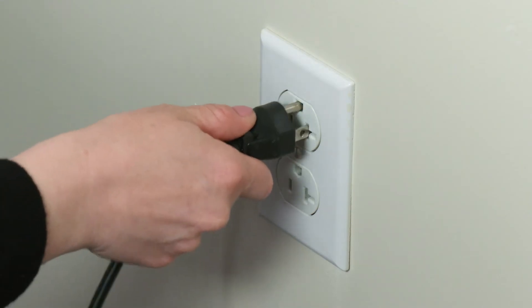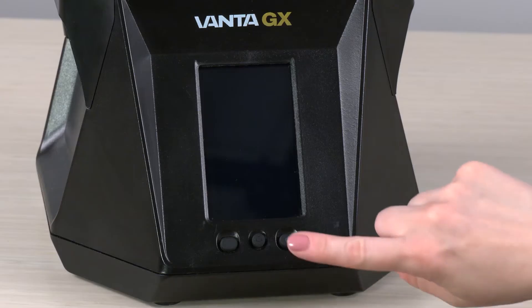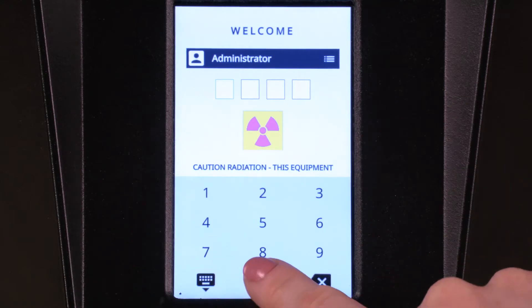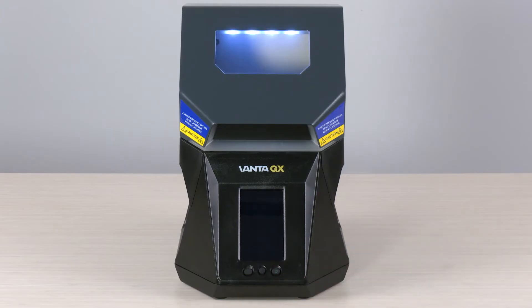To begin, locate an outlet and plug in your analyzer. Power on the analyzer by pressing the Power button. Enter your password. The light in the measurement chamber indicates the analyzer is on.